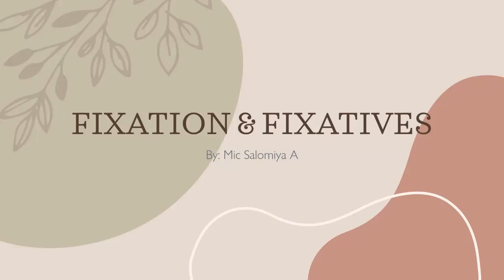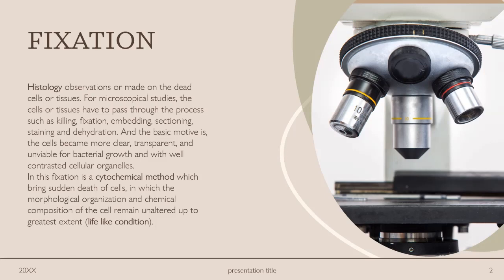Fixation and fixatives. Before going into the topic, first we need to know the word histology.